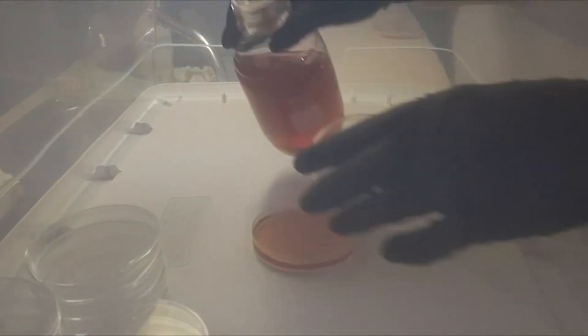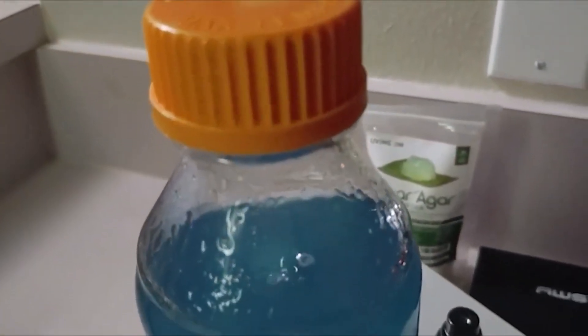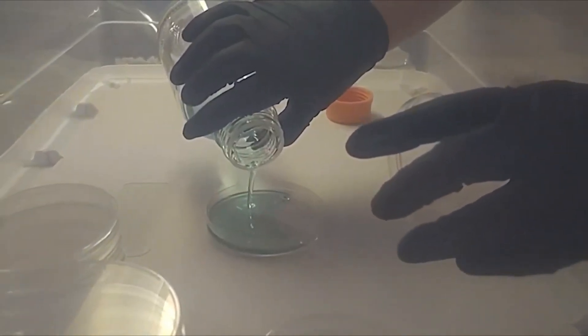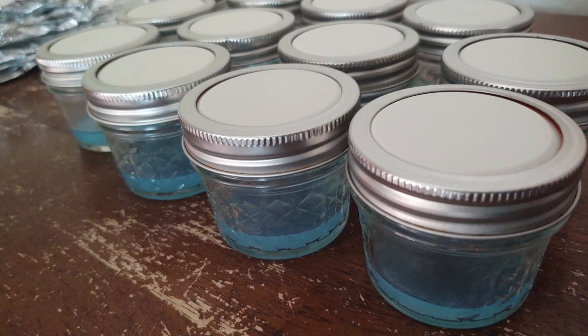Advanced mycologists do not add food coloring to their petri dishes. They will use an actual blood agar dish, or whatever color the dish is for whatever they're trying to grow. There is charcoal, which creates a black petri dish, and blood creates a red or orange dish. It's actually fascinating to learn about the colored agar dishes from a mycologist, not a home mycologist, who doesn't use food coloring.